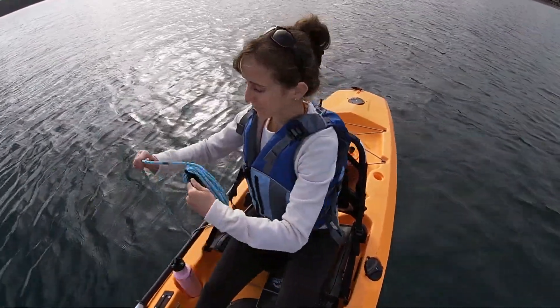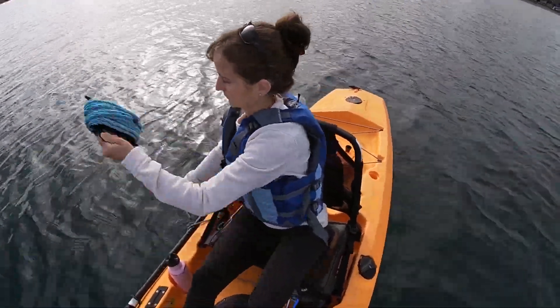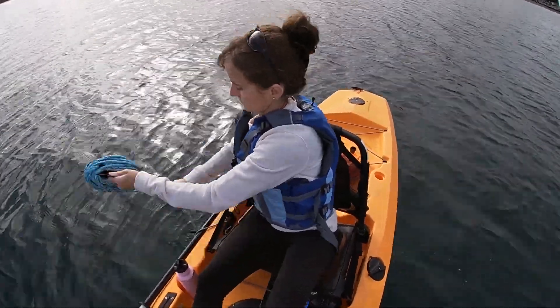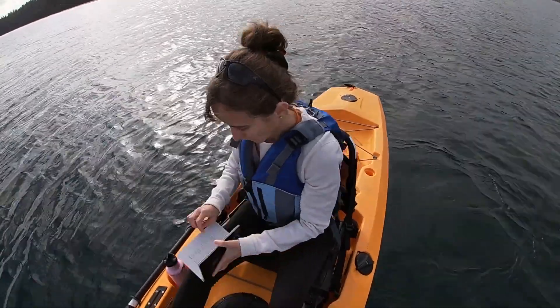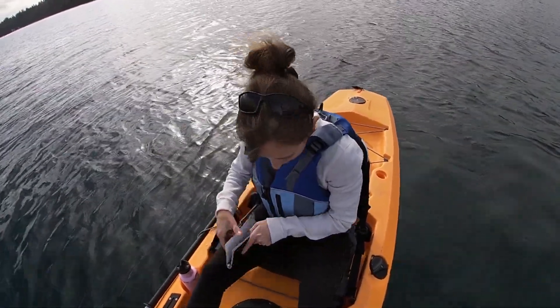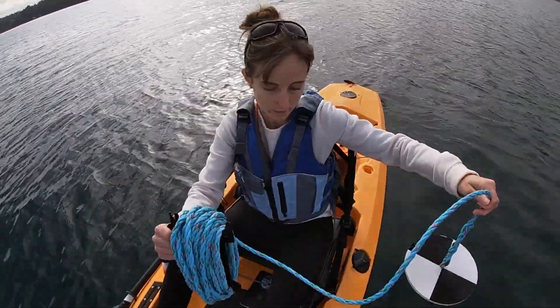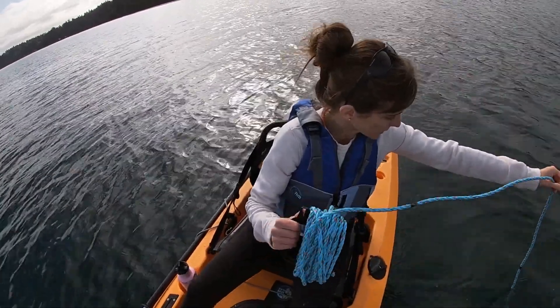I need to record that in my notebook — off the north side of the boat, seven meters. Usually I just do two measurements while I'm out here. The other one I'll do off the other side of the boat, and usually they are very close, if not exactly the same.